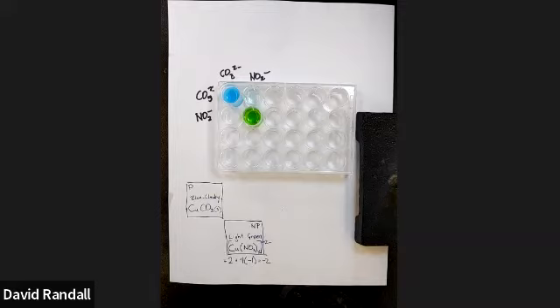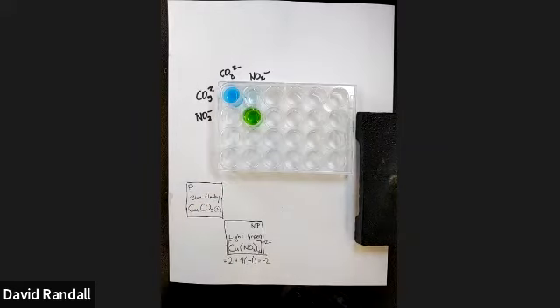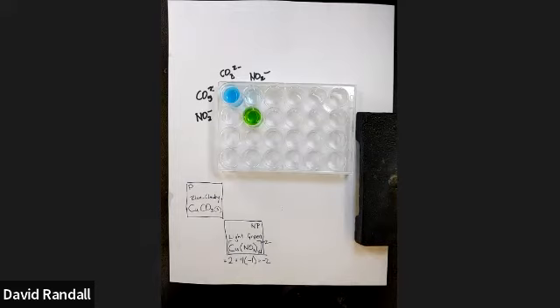It so happens copper nitrite does not form a precipitate. It so happens that copper carbonate does. So these are our authentic standards. If I had another one, perhaps I would do it down here and so forth.